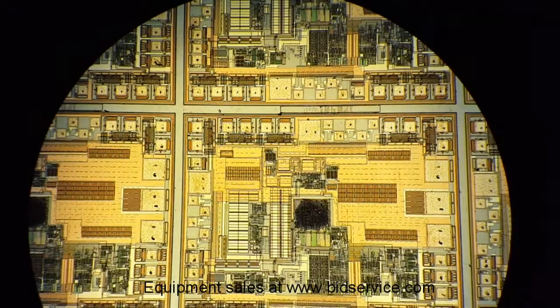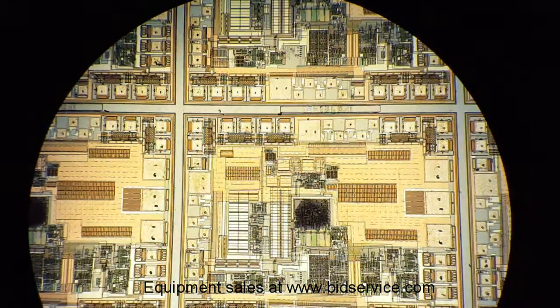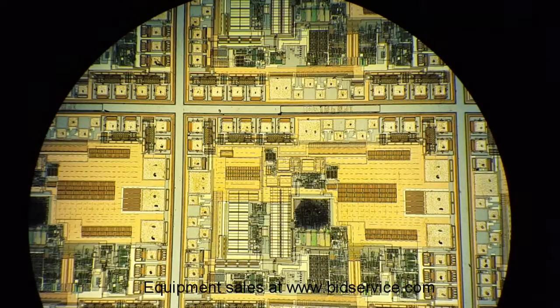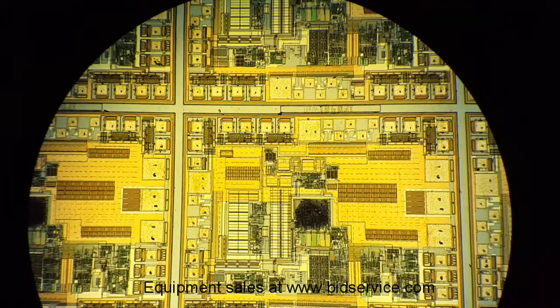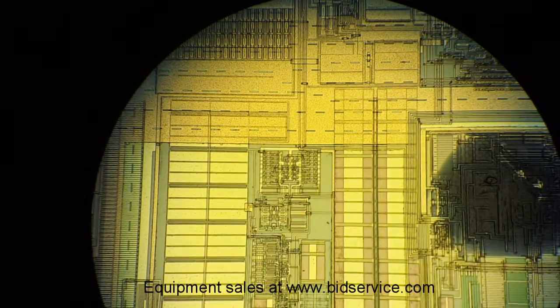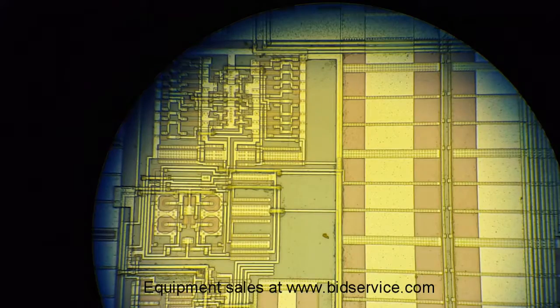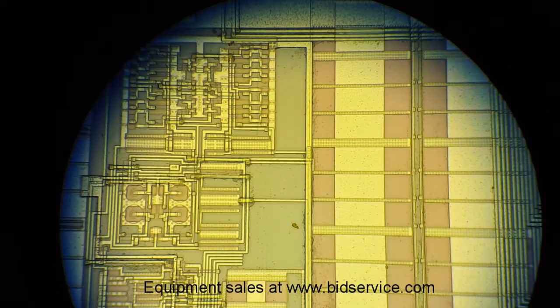Now I've put it on bright field. I'm playing with the brightness but the camera is adjusting for it. That's your 5x, 10x, 20x, and 50x — and that was with no focus adjustment needed.